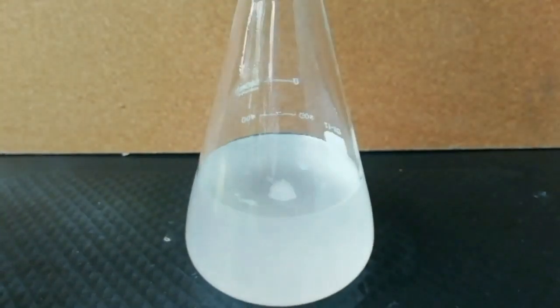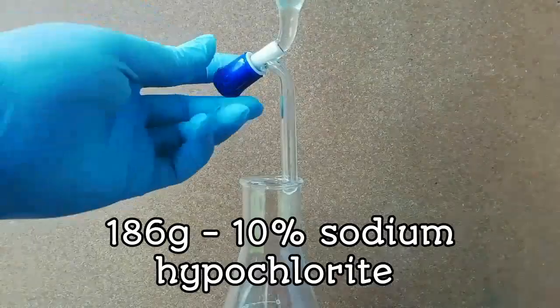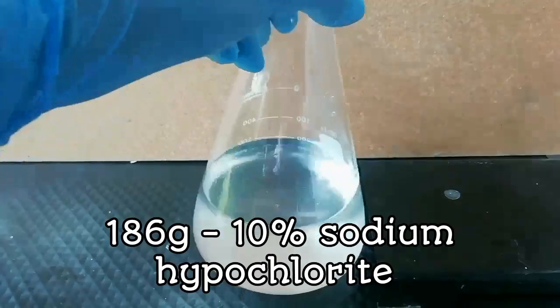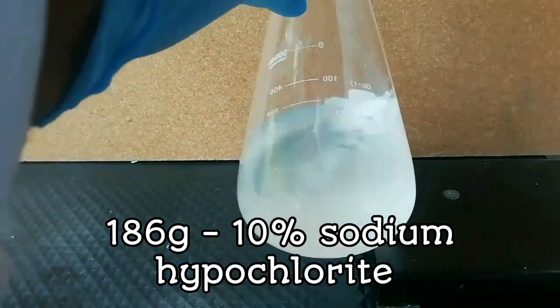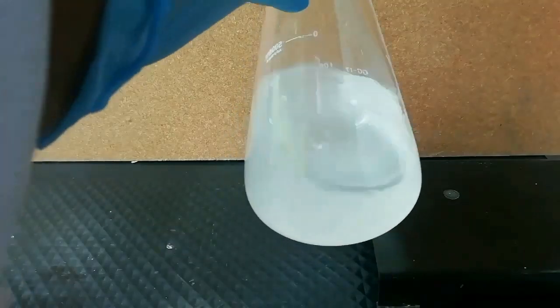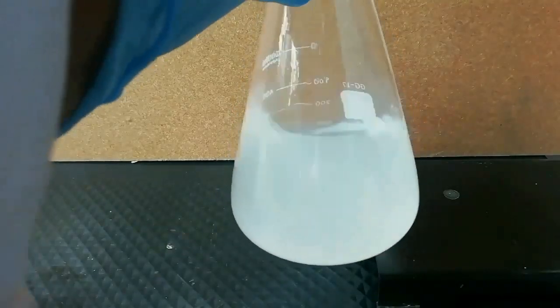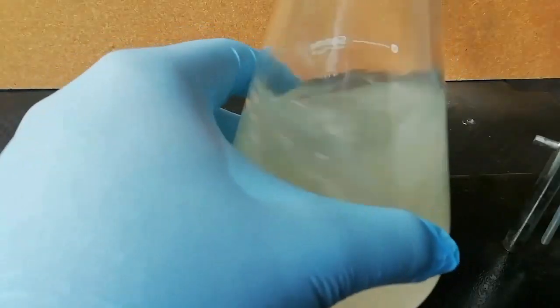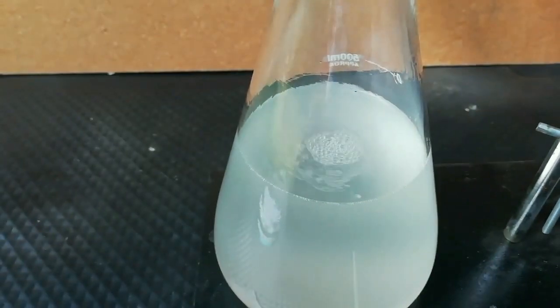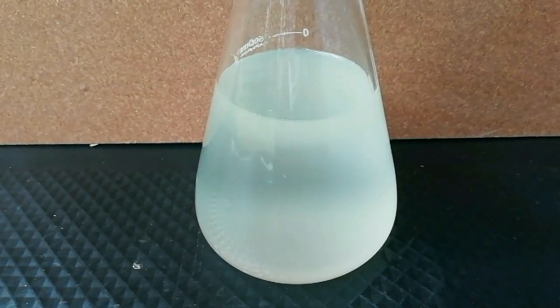Ammonia and MEK will separate into two layers if mixing is stopped. After that, slowly add 186 grams of 10% sodium hypochlorite solution dropwise. I use a separation funnel for that. After 30 minutes, all solutions are mixed well and the solution seems cloudy.